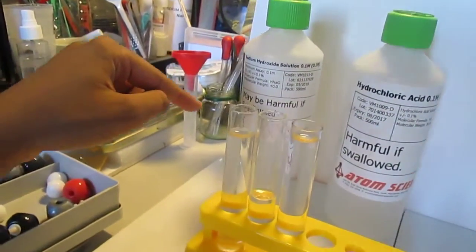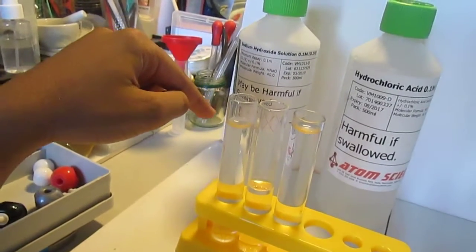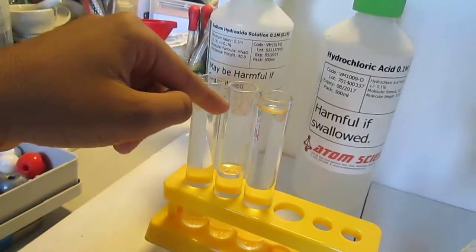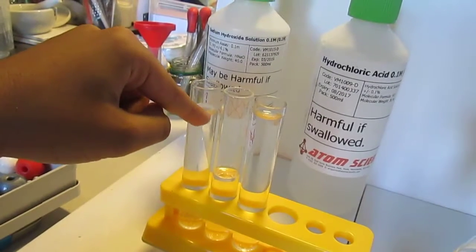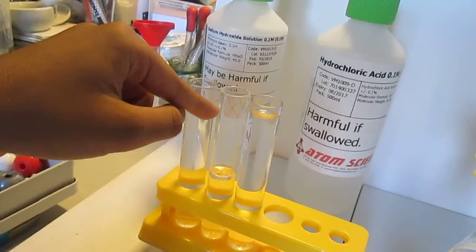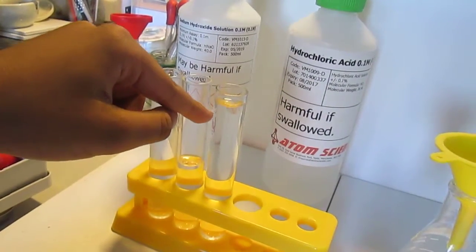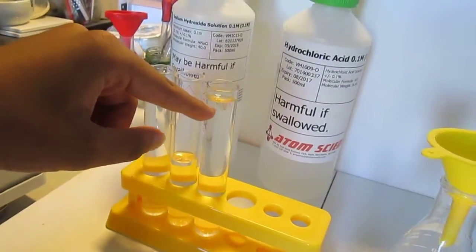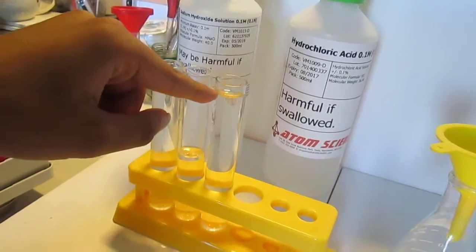The first test tube on the left contains phenothaline. The second test tube on the left contains sodium hydroxide which is a strong alkaline. The third test tube contains hydrochloric acid which is a strong acid.